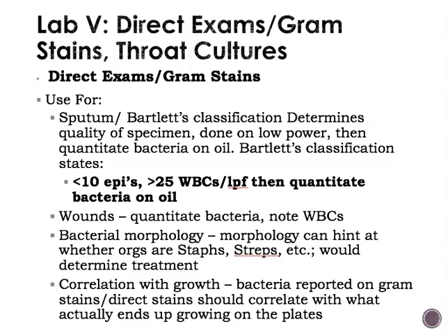And just make sure white blood cells should stain pink. So if you're seeing lots of purple, this could mean that the sputum is smeared on the slide too thick, and if that's the case, then it can't decolorize properly.